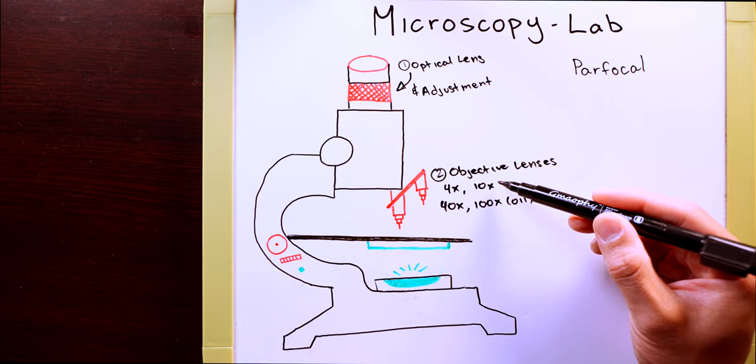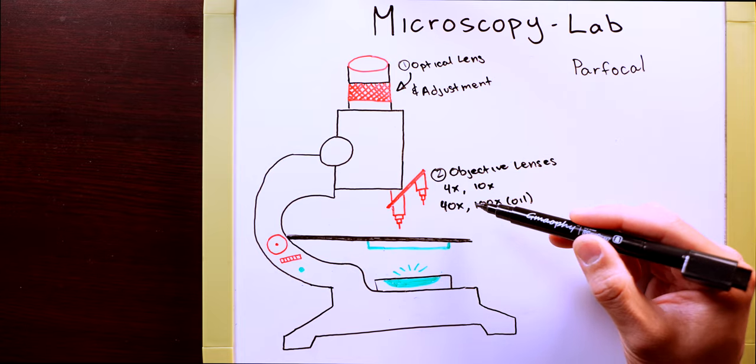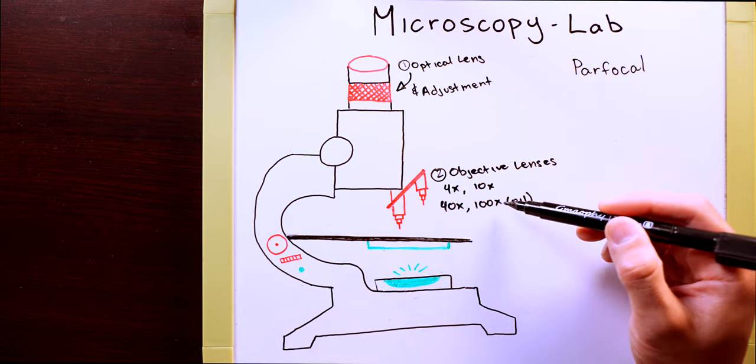And then once you have your objects centered and in focus, you can move it up to the 40x and then into the 100x oil immersion.